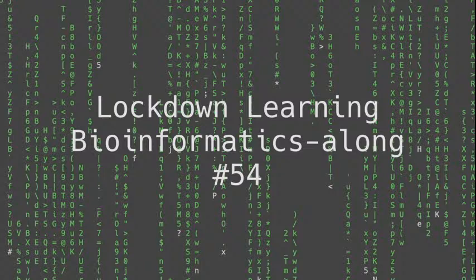So I'm going to talk about genome assembly, particularly prokaryotic genome assembly, but everything applies to larger genomes as well. We'll see how much we can get through, but I think we'll take a look at some of the principles behind genome assembly and how a lot of the major algorithms work, and then we will look at assembling.